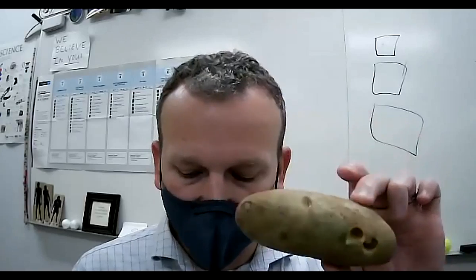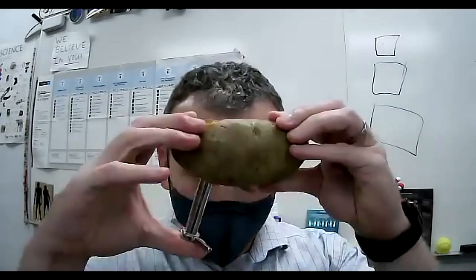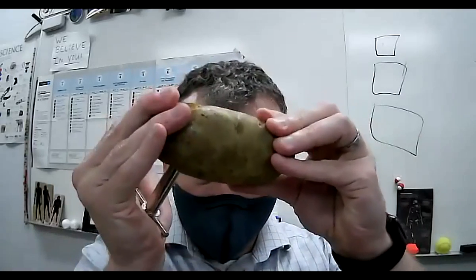Well, this is an Idaho russet, okay? So we're gonna be taking core samples from this. To do that, I use this cork borer. So I put the cork borer into the potato, and I press through it.